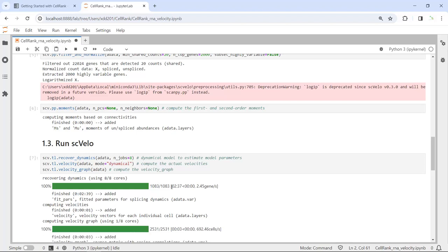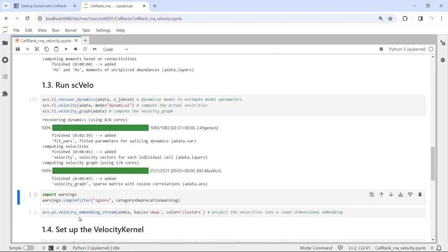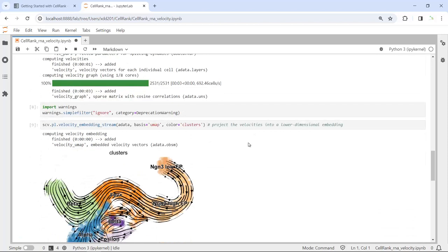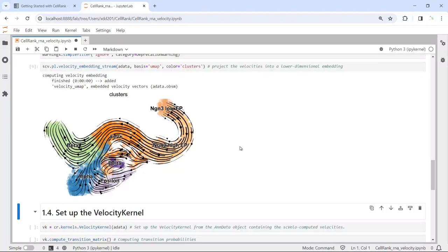It took nearly three minutes to run the recovery dynamics, then just one second to compute the velocity, and three seconds to compute the velocity graph. We have basically finished the scVelo analysis. Then we can embed the velocity trajectories into the UMAP.